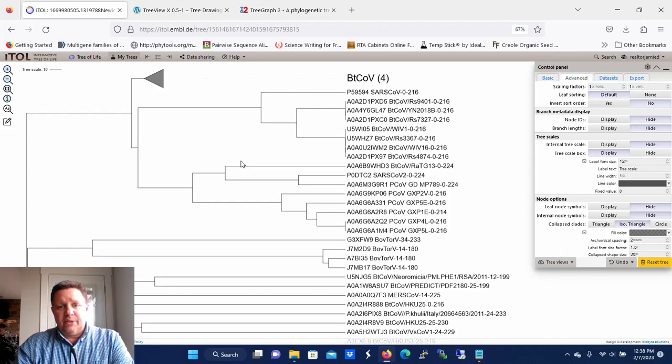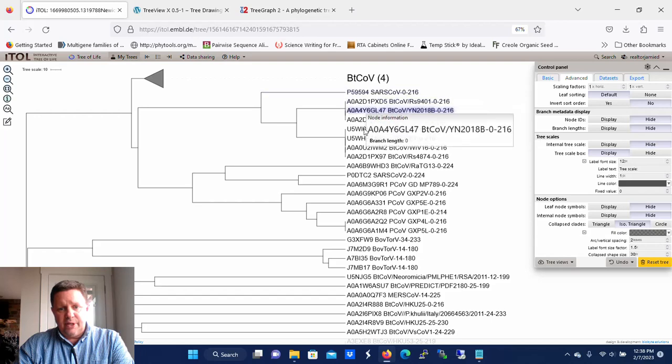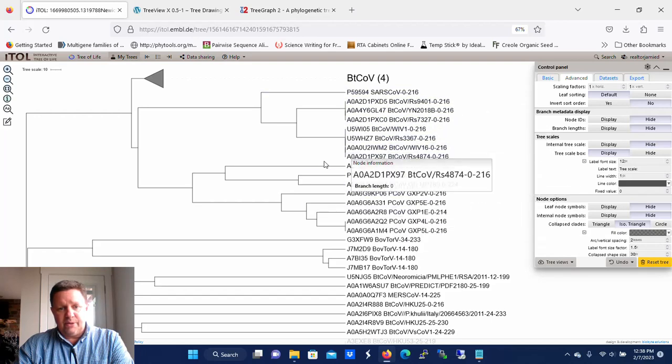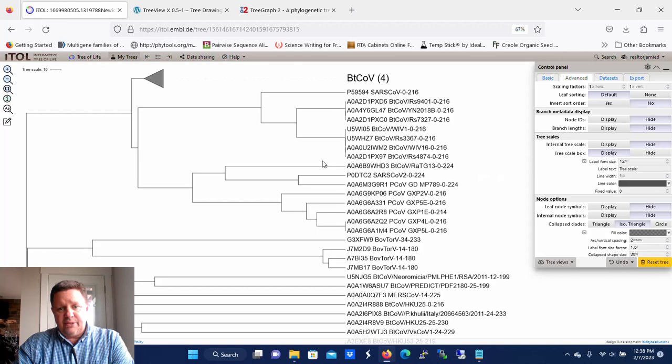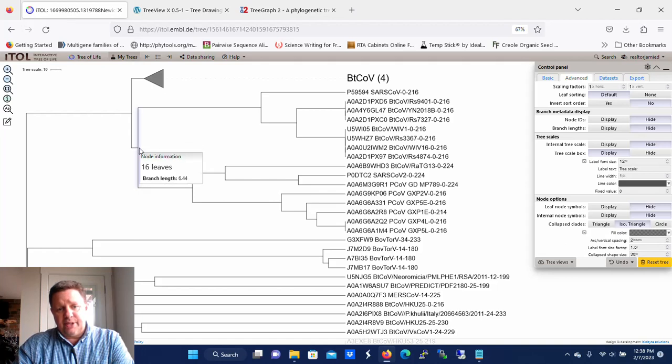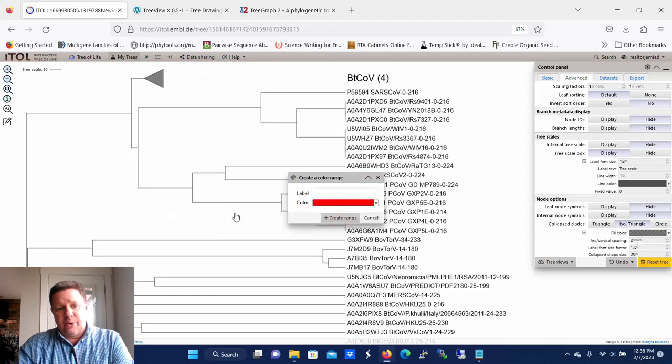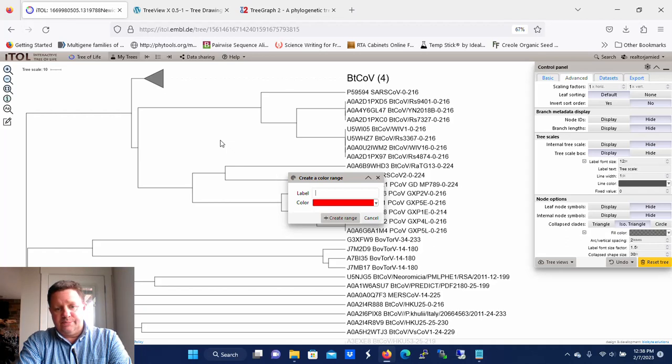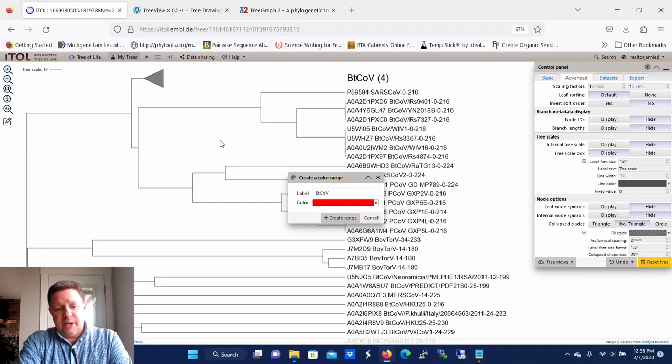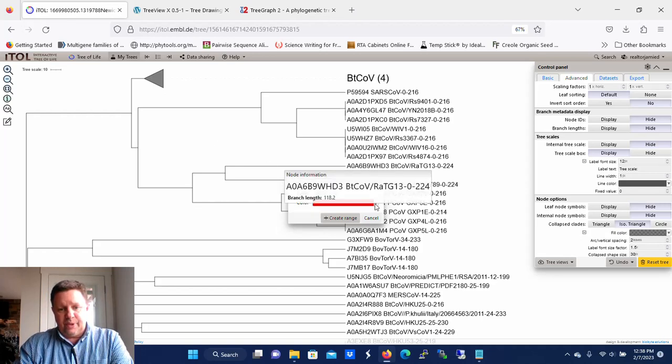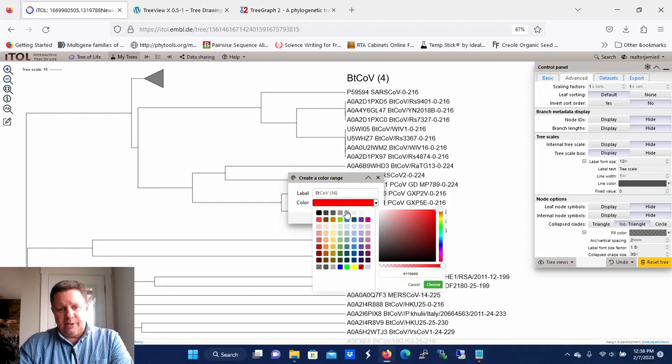Now we have this clade here that also has many coronaviruses in it. In this case, let's say that I just want to set them apart. So again, I'm going to click back here at this node and there's 16 leaves. I'm going to click there and now I'm going to go to Colored Ranges and Create New Range. We're going to call this range, let's call it Beta Coronavirus, and put the number in there, 16. Then we're going to set a color for it, so we can click here, set the color. Let's pick kind of a light blue. And then we're going to click Choose.